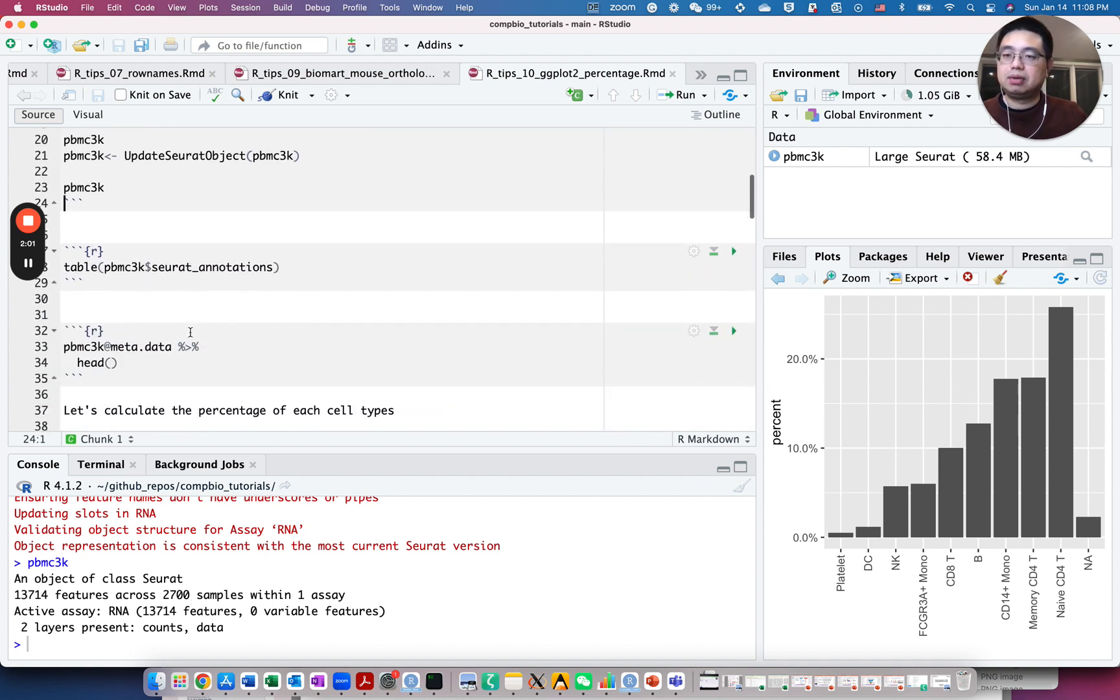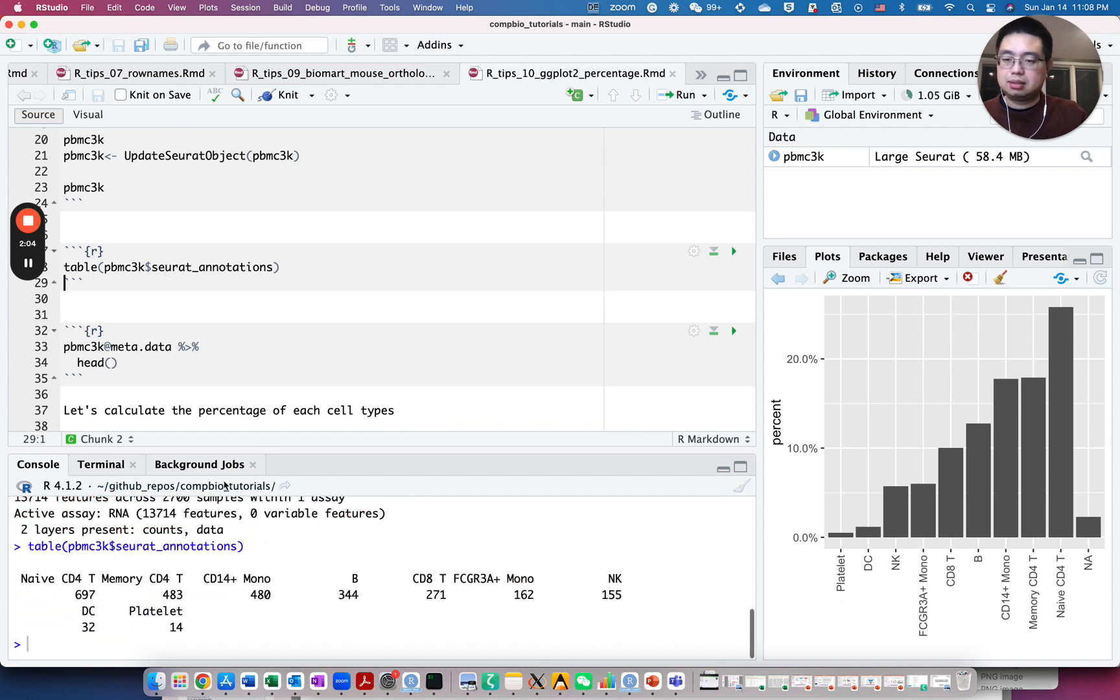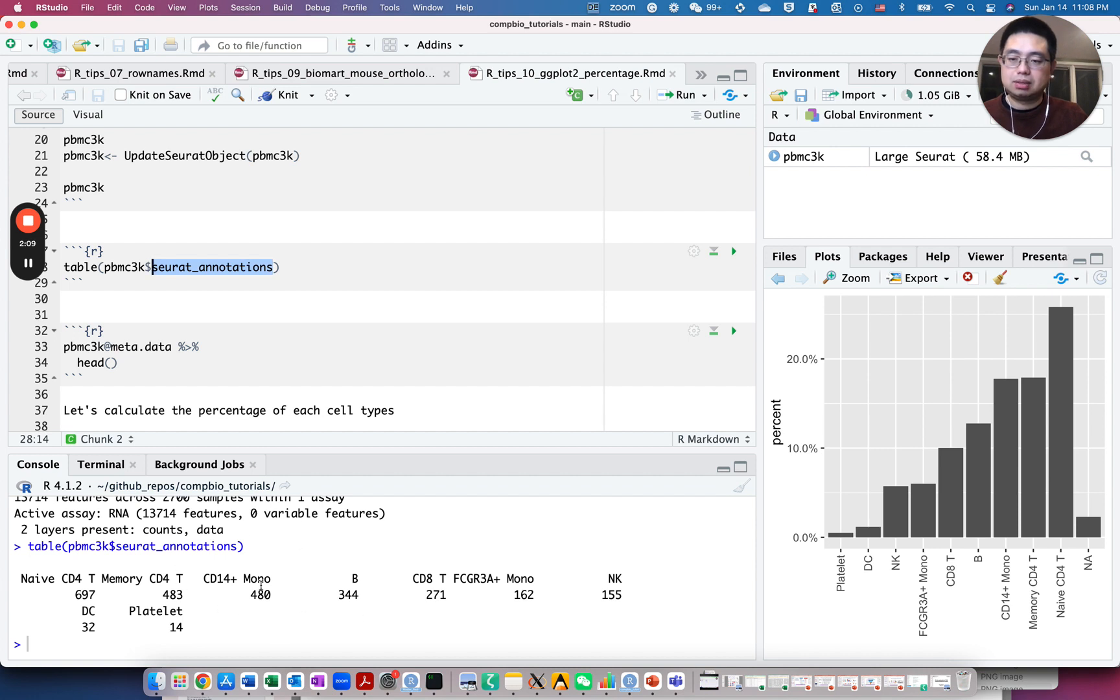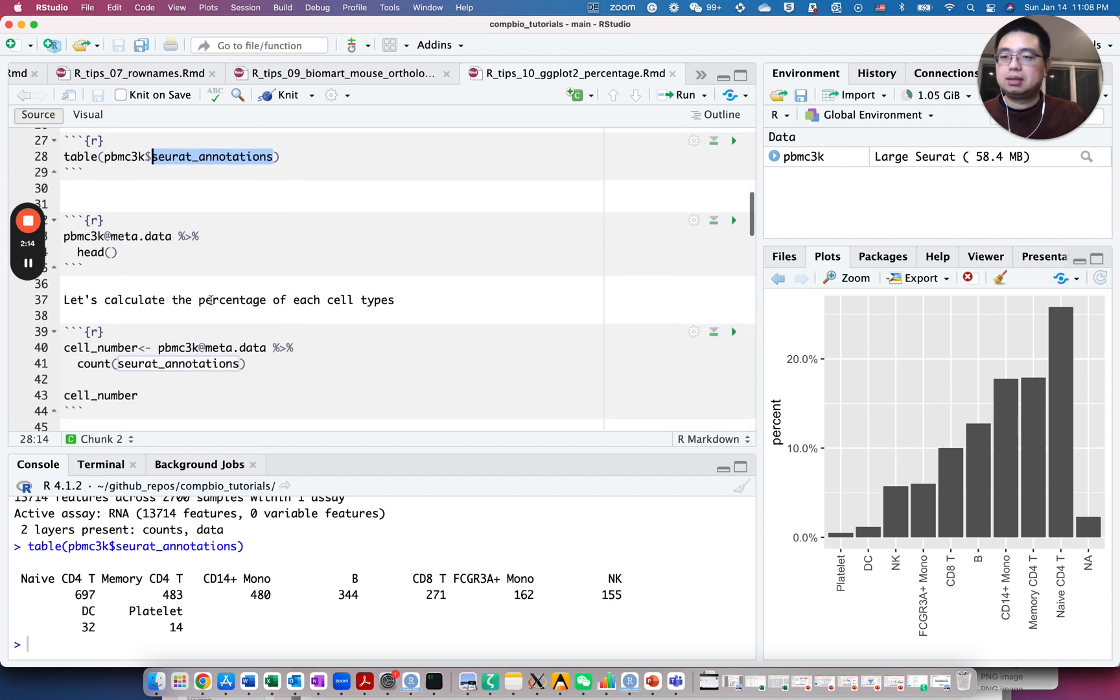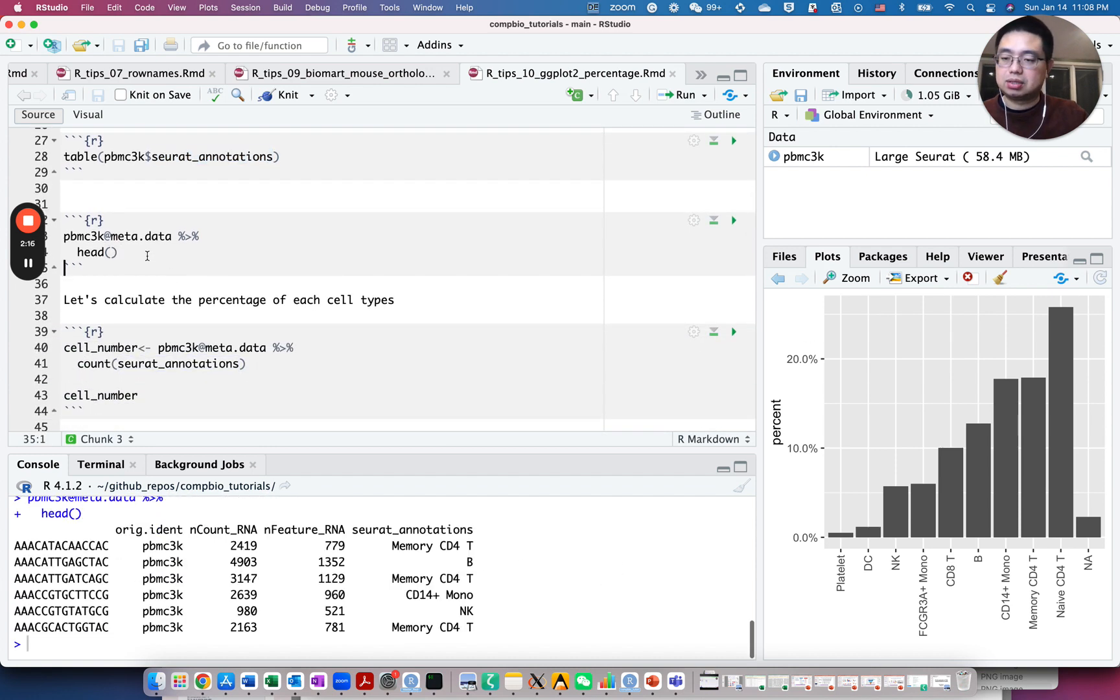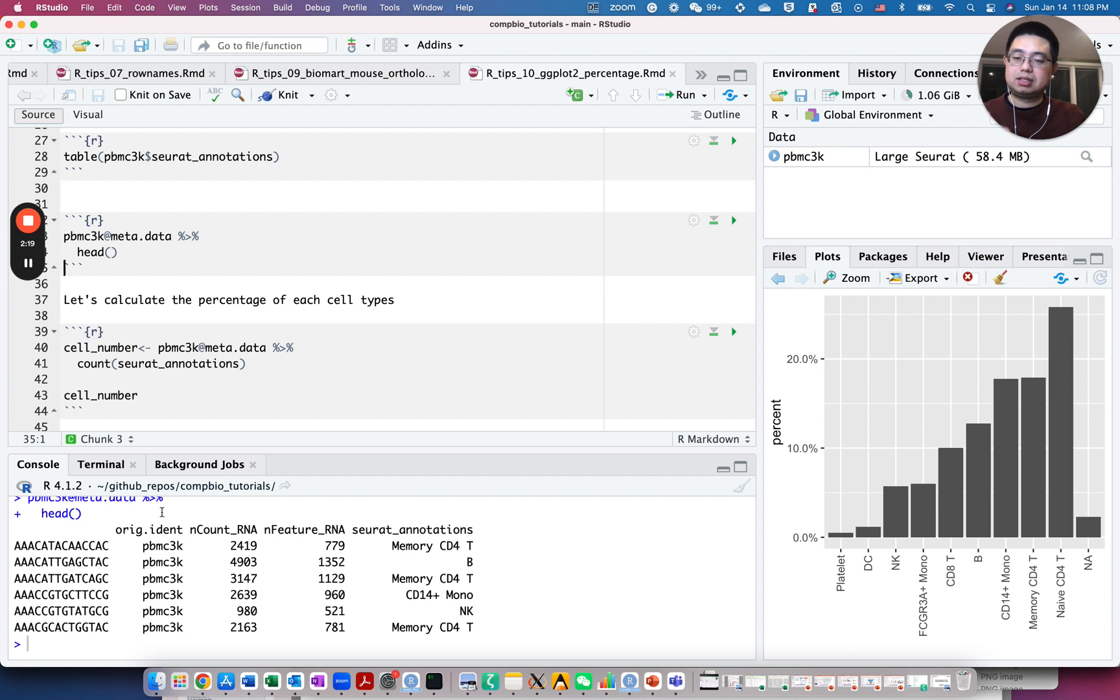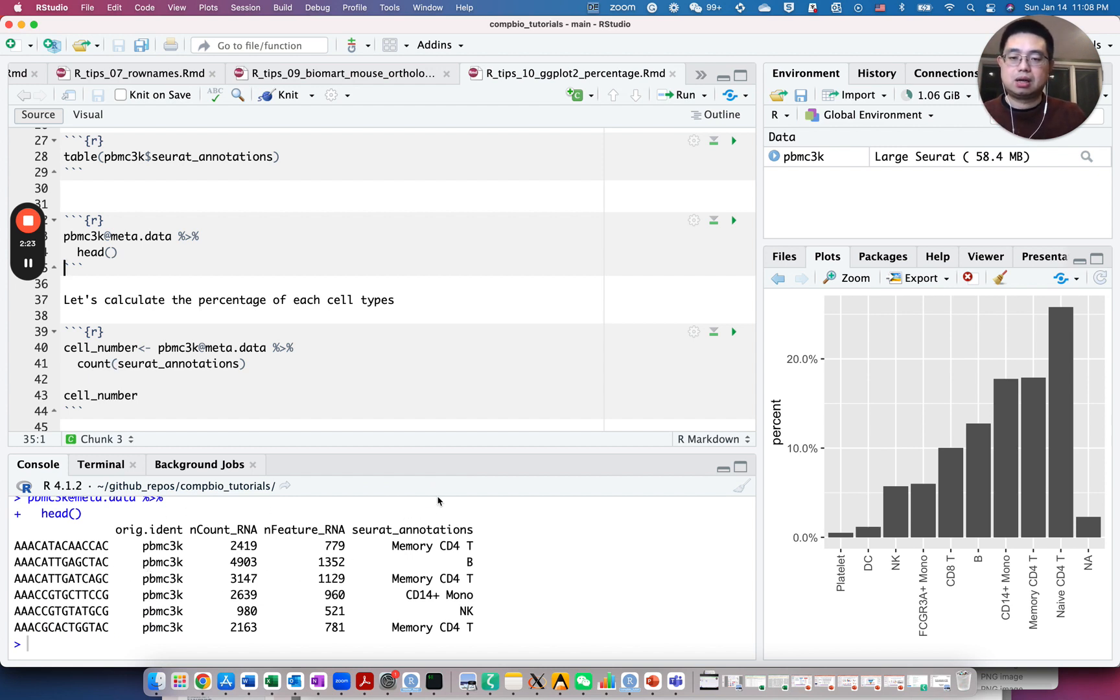If you look at the Seurat annotations, the cell type annotations, you'll see those are the cell types and the number of cells for each cell type. We can just look at the metadata slot. So essentially for this dataframe, each row is one cell, and then this column is the annotation of that cell.